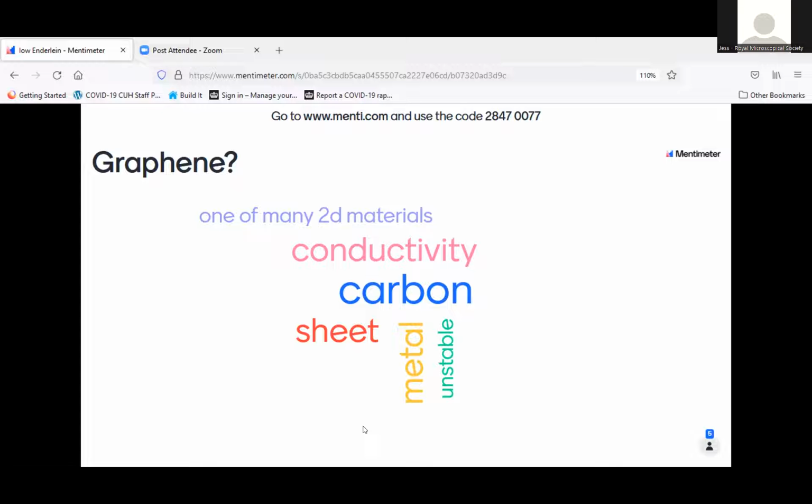where you have labeling in the top and bottom leaflet, and where the lifetime now, due to the graphene interaction, is different in the top and the bottom, you can now use fluorescence lifetime correlation spectroscopy to look at the diffusion of dyes in the top and bottom leaflets separately. And indeed, yes, we have done these experiments, and they look very, very nice.